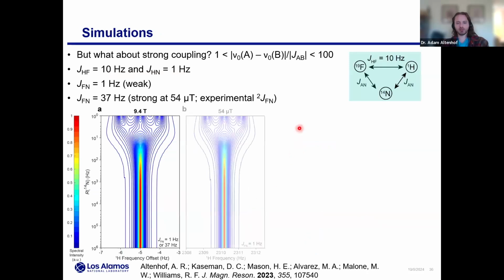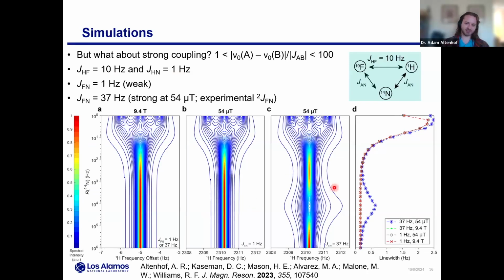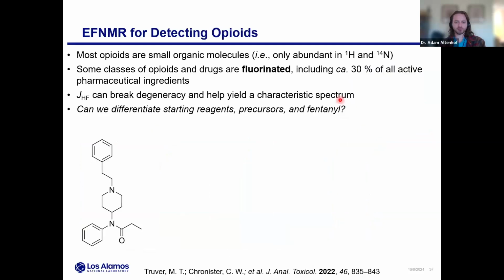Now, what was unique about the Earth field NMR, I'm really not going to discuss this. This is a bit too much into the weeds. Again, just reference the paper, but there are unique effects that happen because there's strong coupling between our hydrogen and fluorine and nitrogen. So basically what we saw was these really rapid relaxation rates, which probably won't show up at high field, did cause line broadening effects at Earth's field. So just to say that the Earth's field is going to be more sensitive to these quadrupolar relaxation effects when strong coupling is present than would happen otherwise.